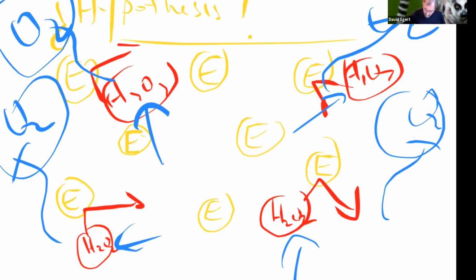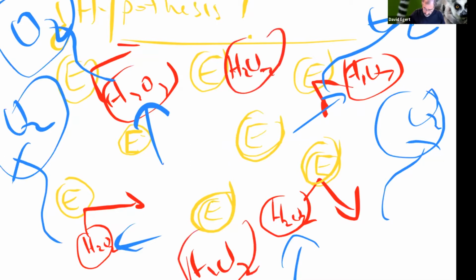Assuming that you've got enough enzyme just waiting, if you keep increasing the concentration of hydrogen peroxide, you're going to have even more oxygen being made per second because you've got more of the reaction all happening at the same time. So this would be a positive correlation, right? An increasing concentration of substrate, increasing the rate of the reaction.